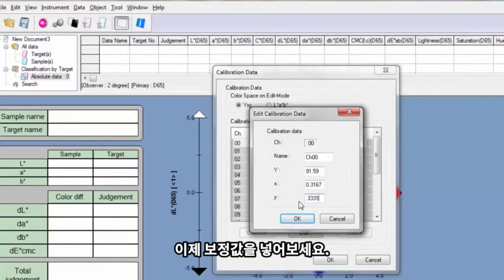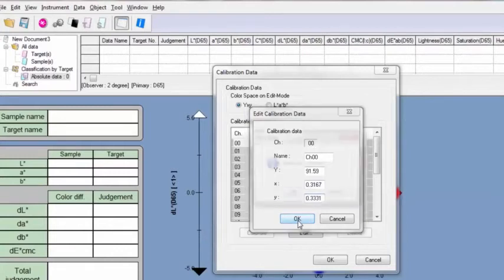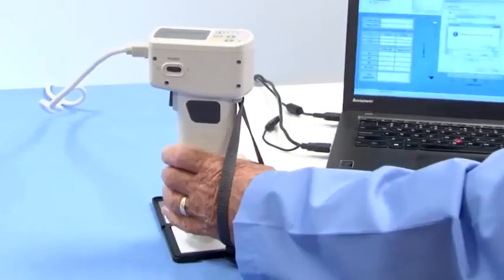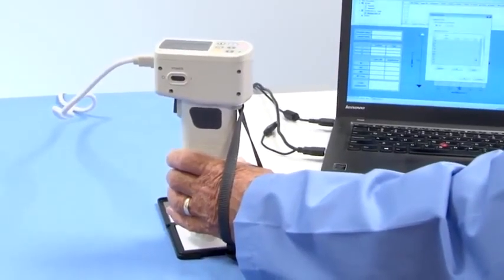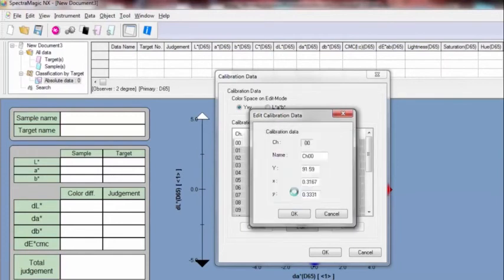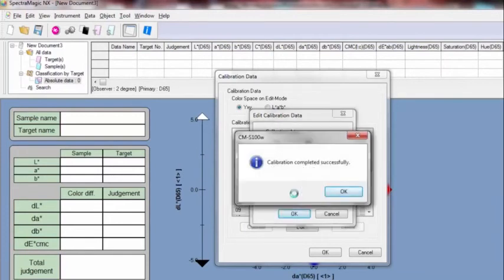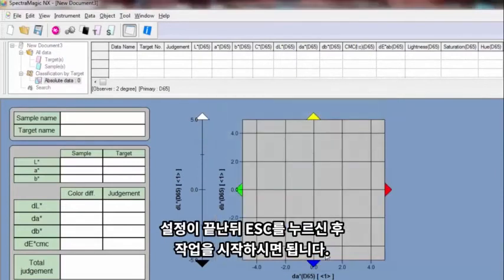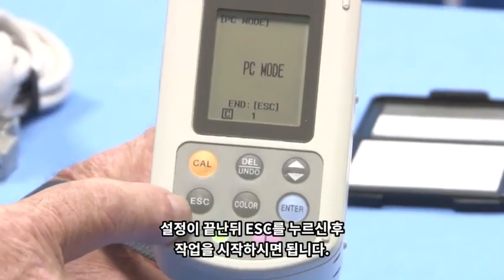Now calibrate your instrument. When this is finished, press the Escape key and you're ready to measure.